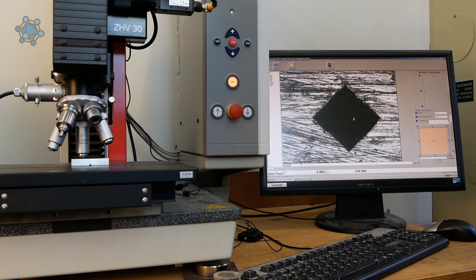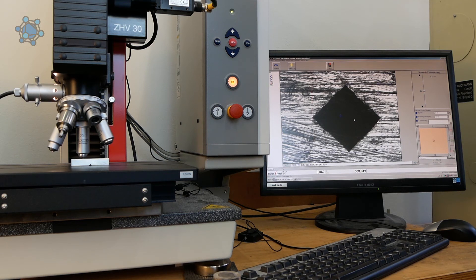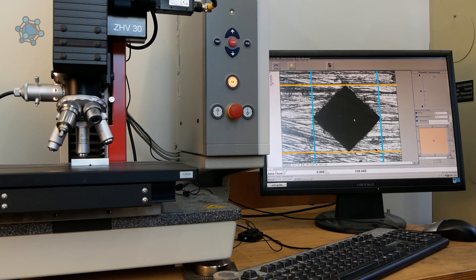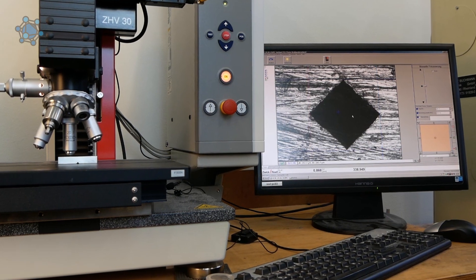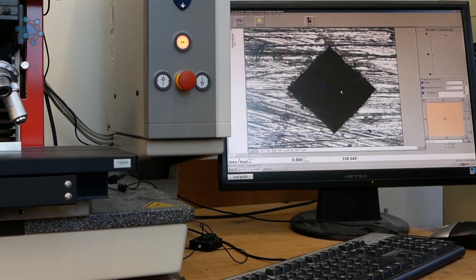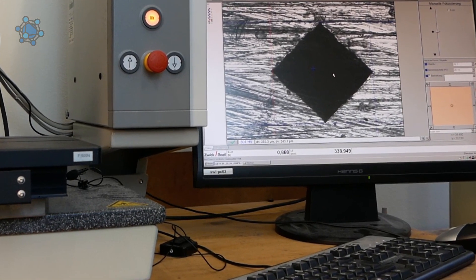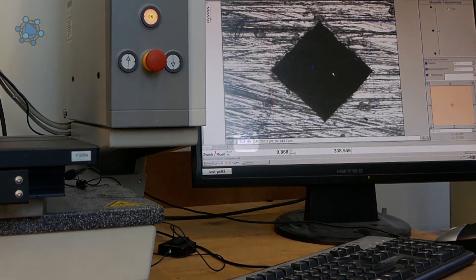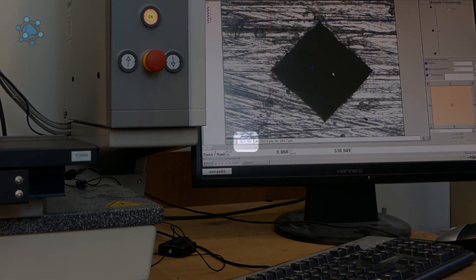The enlarged indentation is shown on screen. The software searches for the indentation via a light-dark comparison and delimits it with four lines, so that the diagonals can be measured. The hardness of the material is displayed on the screen and is 301HV.